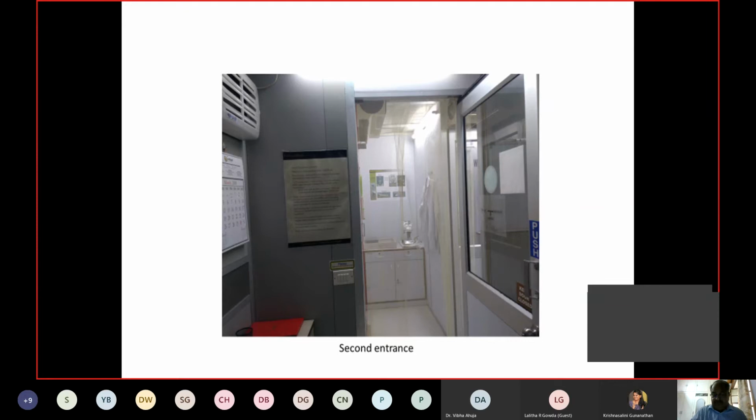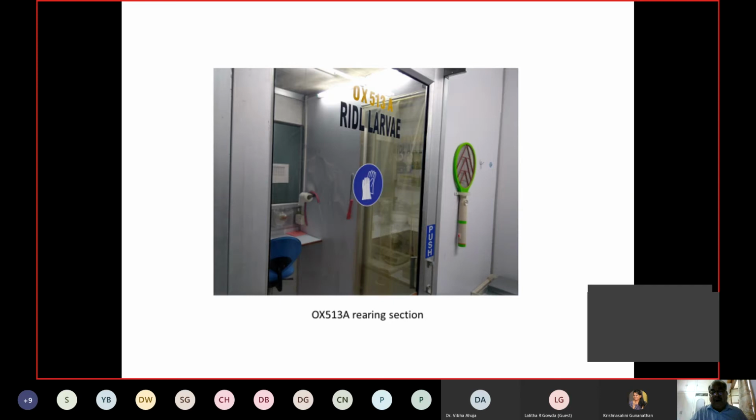Minimum level is 2. There has to be one anti-mosquito bat or racket for meeting any warranted situation where a mosquito is found flying freely around, and this, without knowing whether it is wild or transgenic, has to be immediately tapped, trapped and destroyed. So no mosquito of any kind, because we do not know whether this mosquito belongs to the transgenic or the non-transgenic, must go out of the laboratory. Therefore, the counting of the larvae, eggs, pupae and adults must coincide. And this is the job of the laboratory maintenance person.